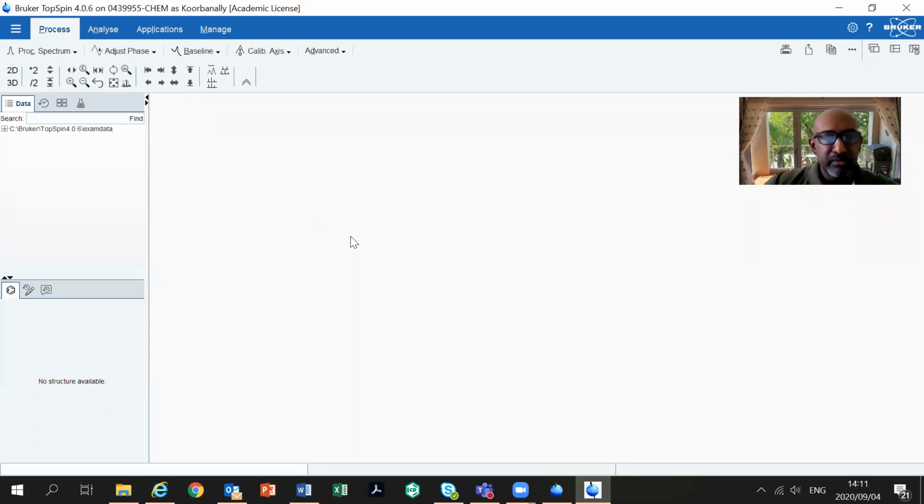Remember, this is freeware off the web that you need to install and play with and try to process spectra. I'll also give you some experiments to play with, a full set of maybe 5 experiments, one for each of the different tasks that you'll be able to do. And you can play around with the program when you download it as well. I'll try to put that onto Moodle for you.